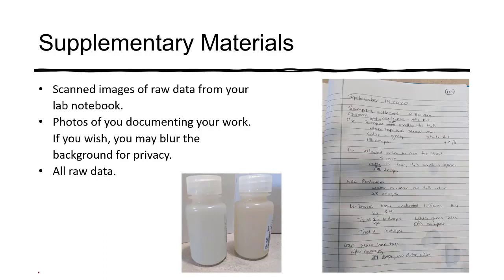I actually went in again a couple nights ago, took some more samples, which I brought over to chemistry, and they will do some additional analysis for much more accurate results for calcium and magnesium. So we'll have much more accurate hardness results for at least a few of these samples. So that's what you'll need to do for this lab.